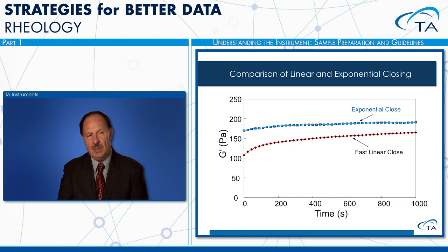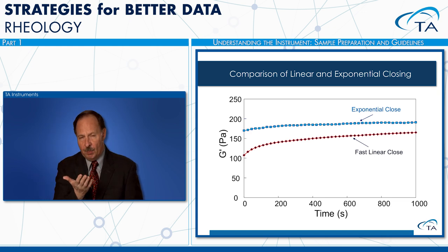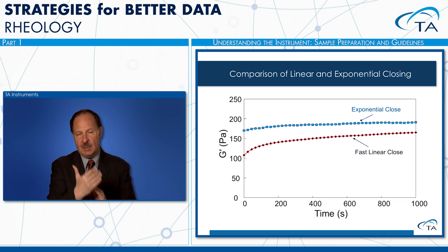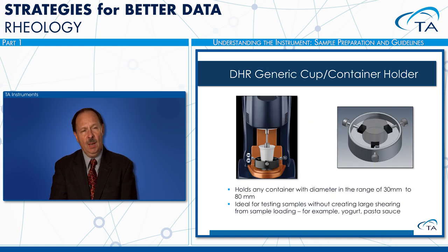And sure enough, we see that there has been some destruction here of the structure. It's building up, but after 1,000 seconds, it's still just kind of approaching what we had at the beginning with our exponential closure, okay? So if you have a material that's sensitive, you have this option of closing things exponentially to avoid this damage of your structure, okay?